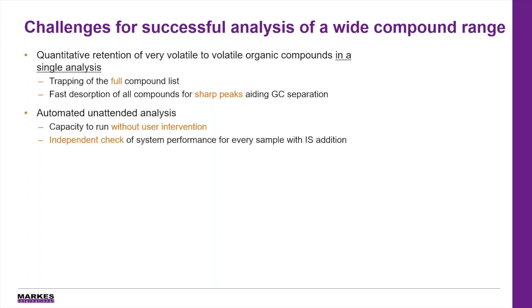It's also important that this system can run automated, unattended analysis. You don't want to have user intervention at every step of the way. And if we're going to have an unattended analysis, independent system performance checks with the addition of an internal standard is important as well.